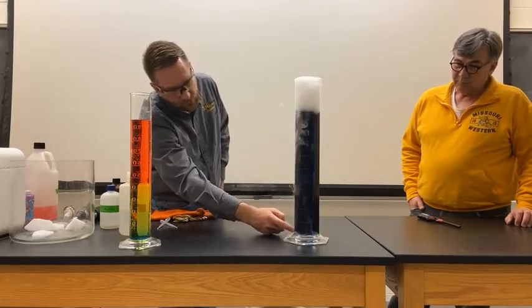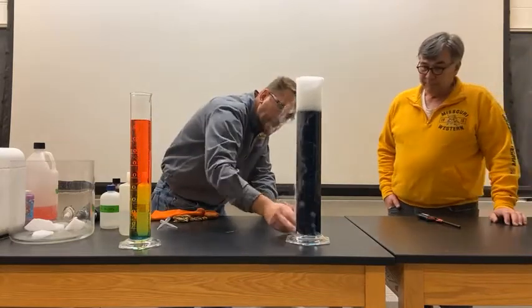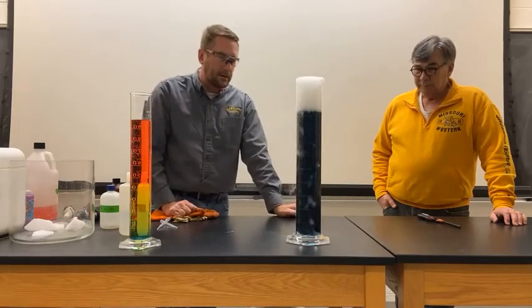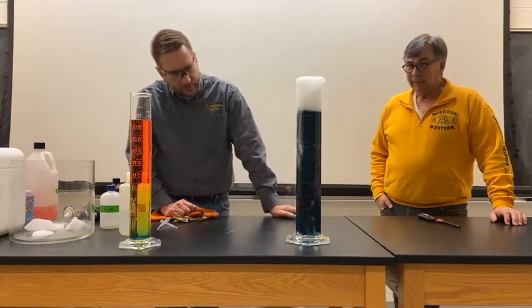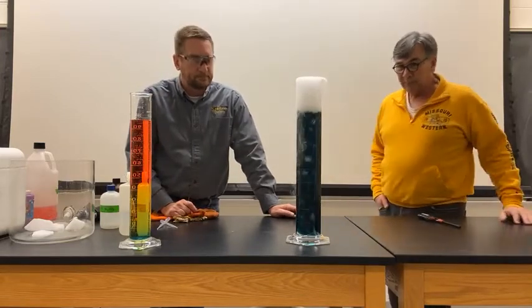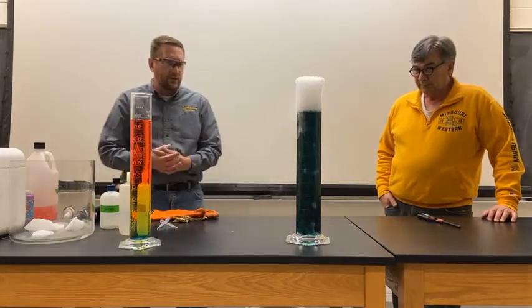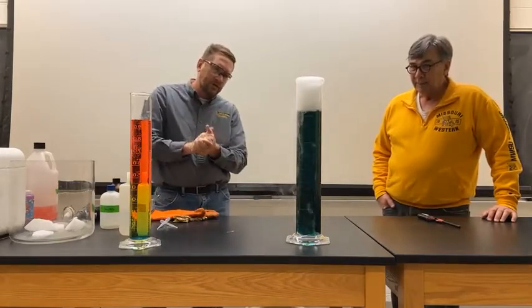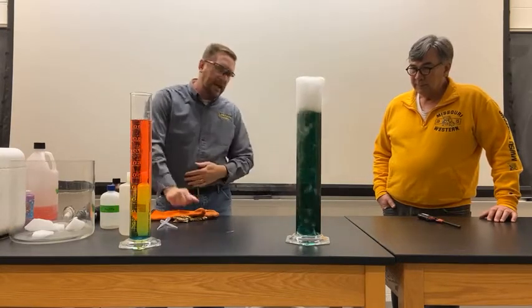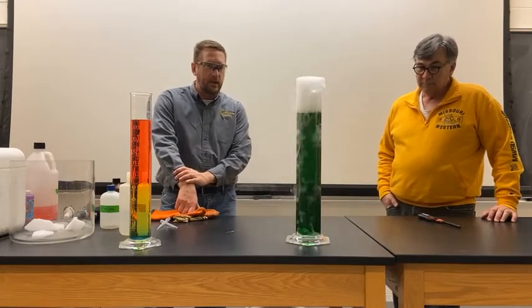Yeah, so now if you look down here at the bottom, I don't know how well you can see that, but it's starting to turn blue down here. In fact, it's almost starting to turn green down near the bottom. Kind of see the green. If the lighting's right, you can actually see the green sort of coming up with the bubbles, and it's no longer that. There we go. So now it's really starting to turn. So we've gone from basic, so a pH probably around 12, to right now a pH of around 7. With that pretty green color there.